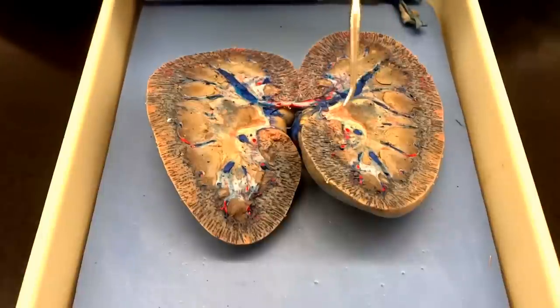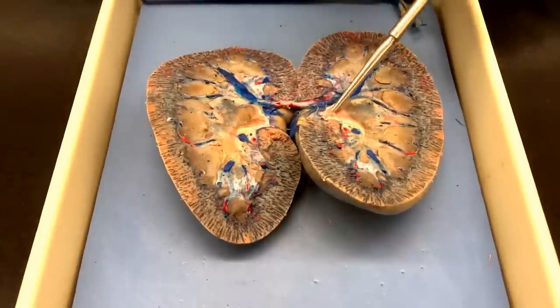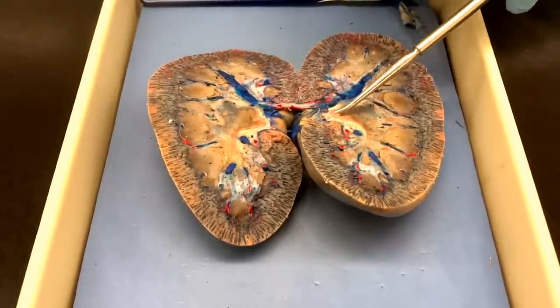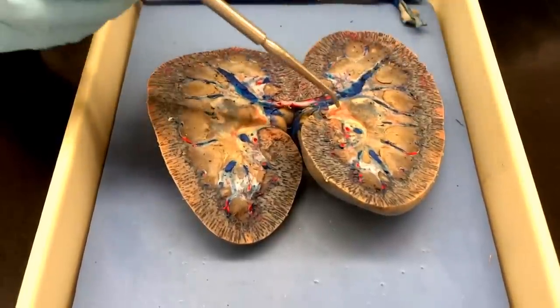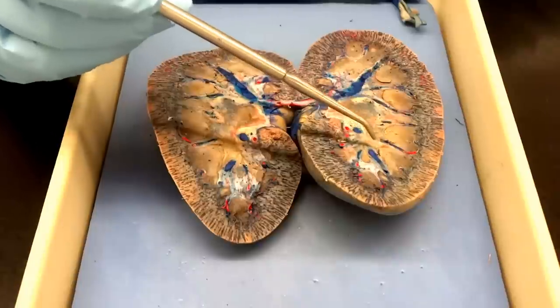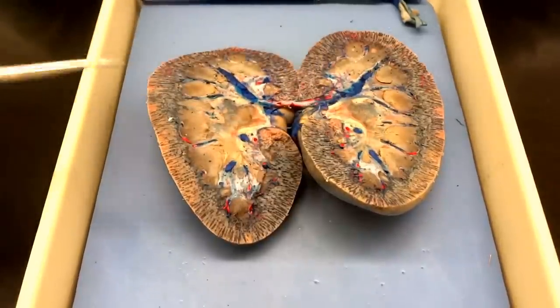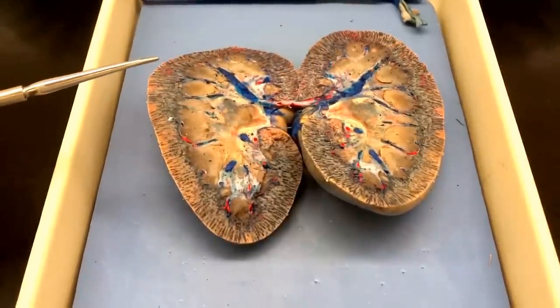Oh yes, you can actually see — she can shove the probe right into the ureter, which is where the urine would be draining out of the kidney and down into the bladder. So, minor calyx, major calyx, and then the renal pelvis into the ureter. Woohoo! Are we done? Yeah! Awesome. Go ahead!